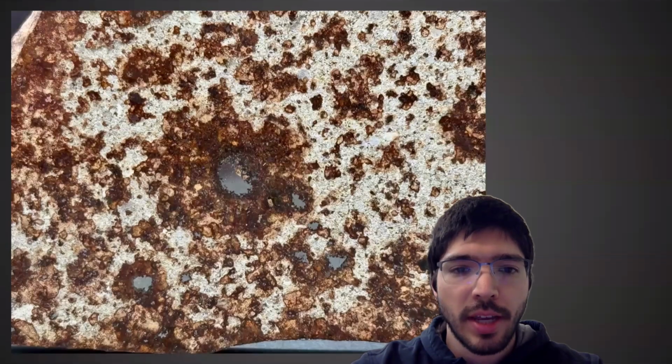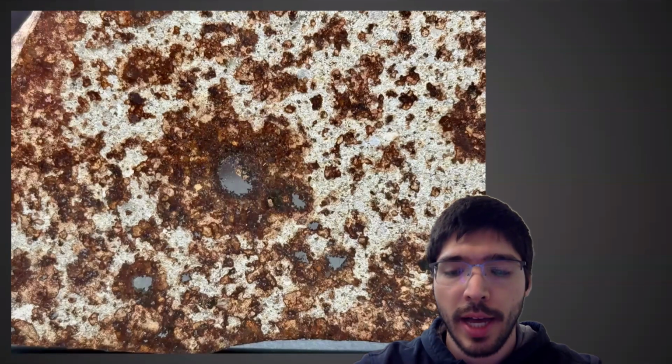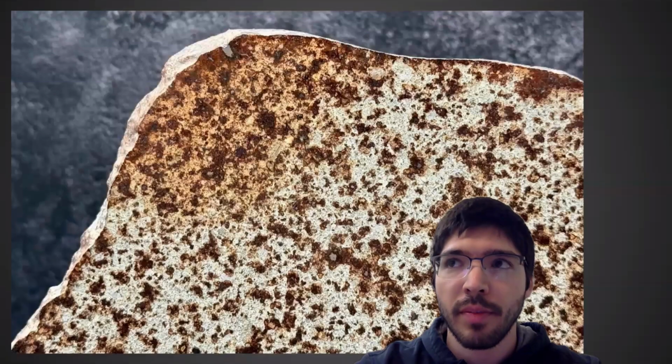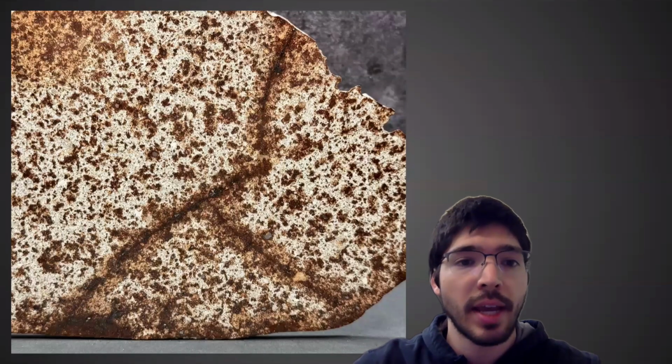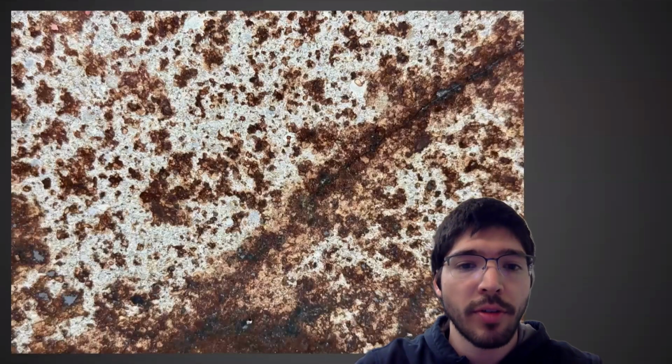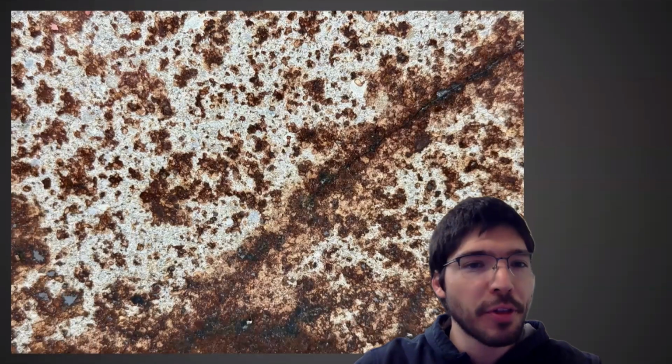Definitely. And also, if you notice any chondrules in there, Topher, and you want to get just a rough estimate as to the diameter for a few of those, feel free to measure those as well. I do have some images of some chondrules from the sample, and I do have a scale bar so I could get some estimates on what their diameters are as well. I don't think it would be too useful for this particular classification.